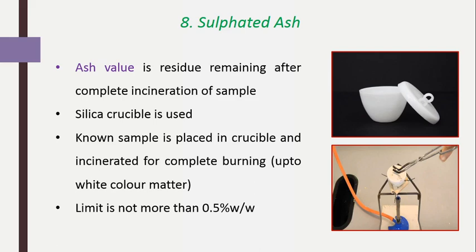After that we have seen the acidity and alkalinity test, where methyl red solution or phenolphthalein solution is used. After that we have seen the absorbency test.